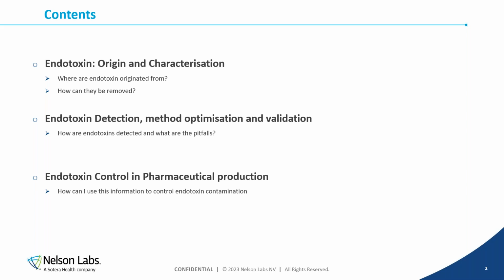And the largest part of my webinar is we are going to use those principles and see how we can use them to perform a risk assessment and to perform endotoxin control.